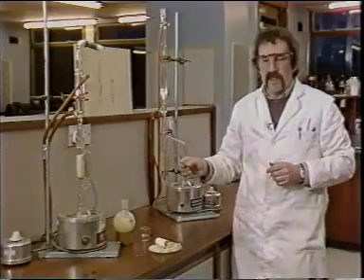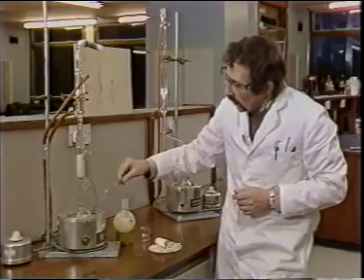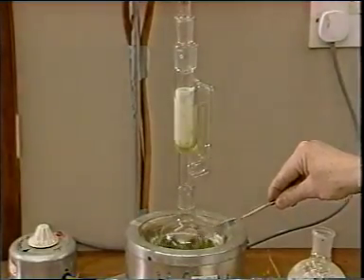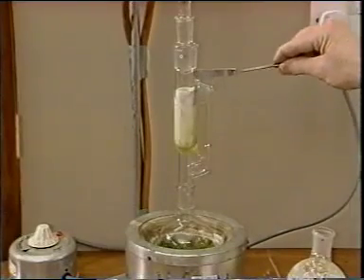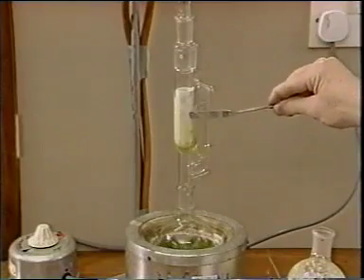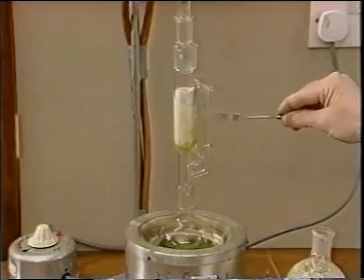Let's look at the apparatus itself. We see that the refluxing solvent rises past the thimble in the siphon, and because this vapour is hot, it heats up the extracting solvent, thus making it an even better extracting medium.